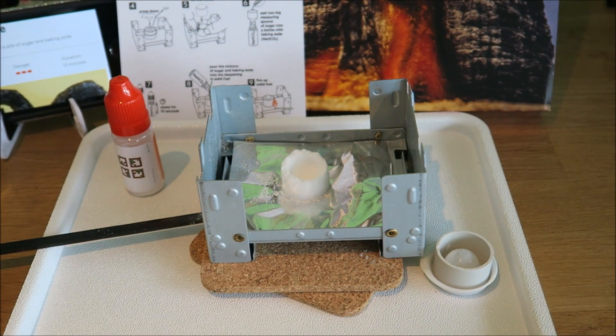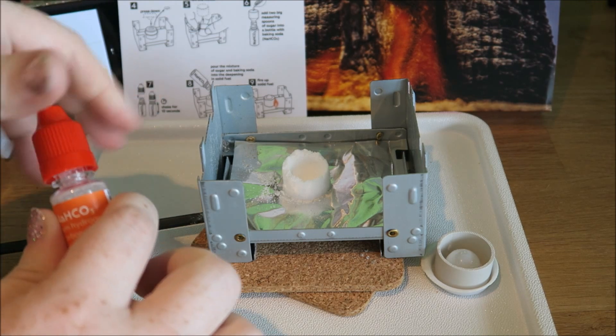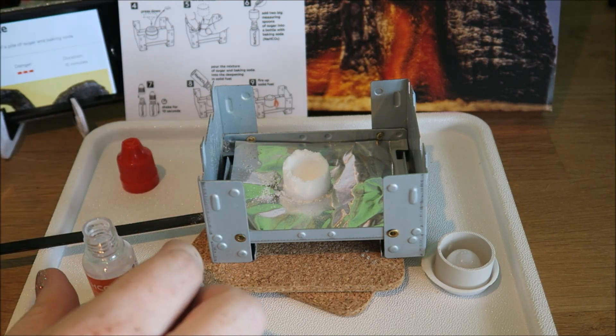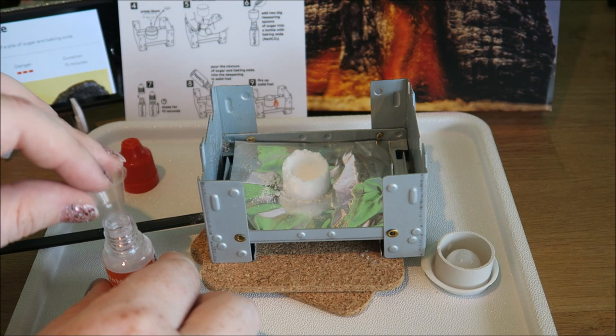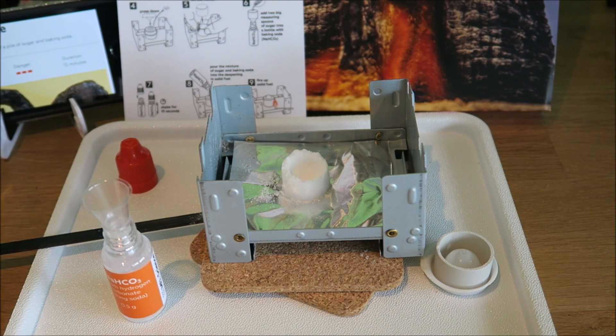Tada! Right, now we have our sodium hydrogen carbonate. Lid off that, a little measuring cylinder, and it wants two scoops of sugar.